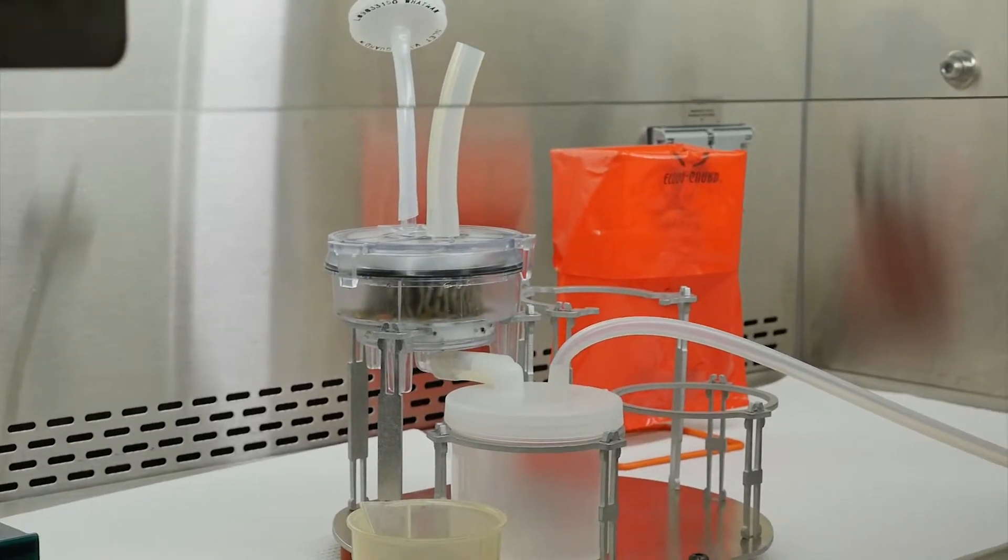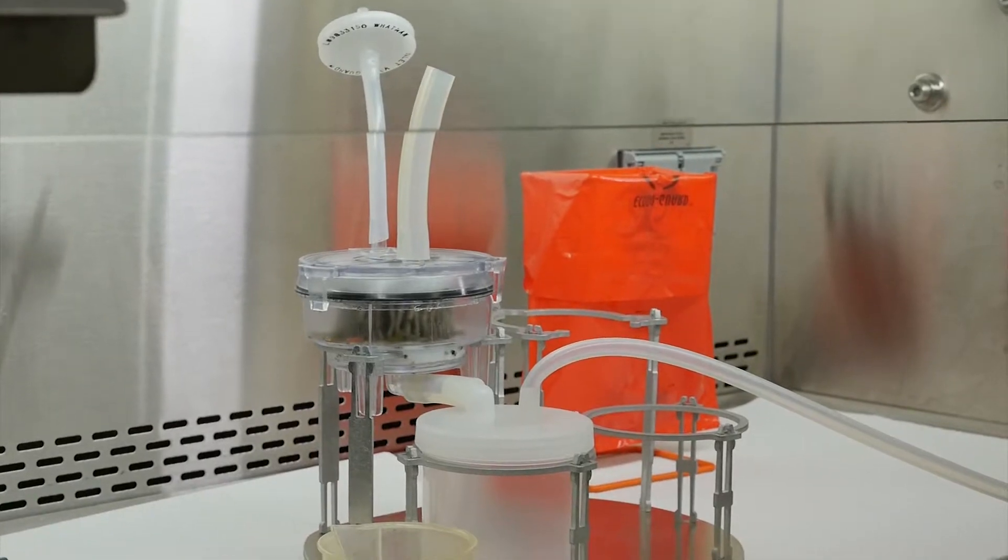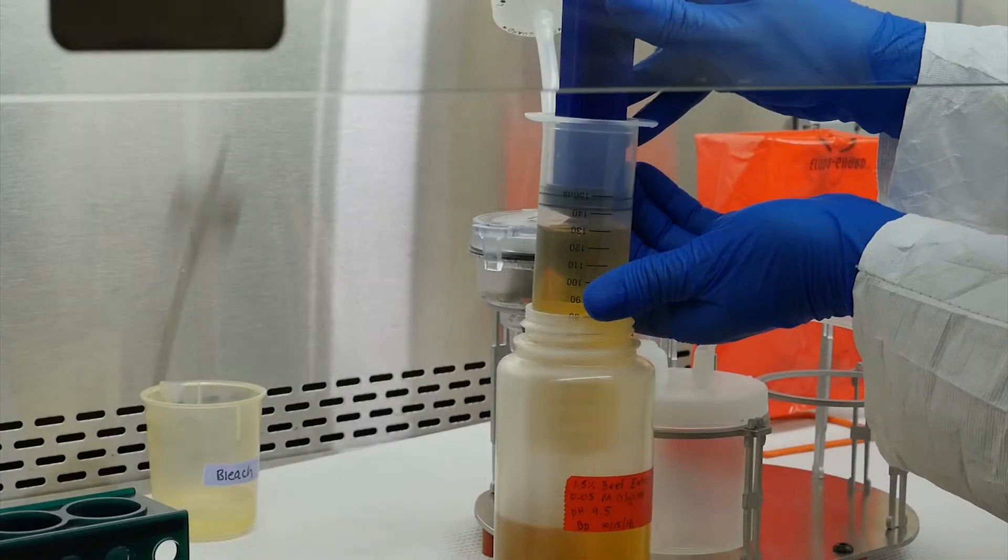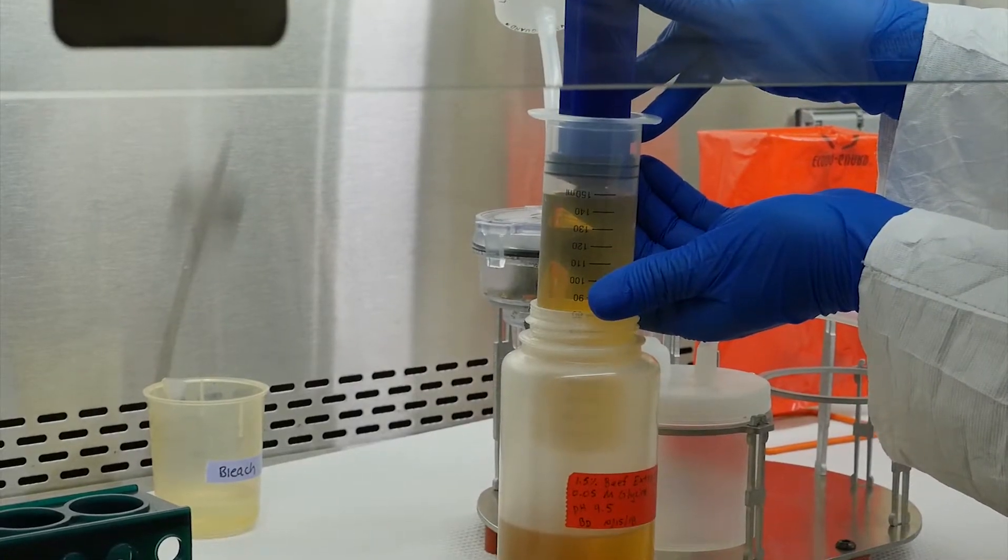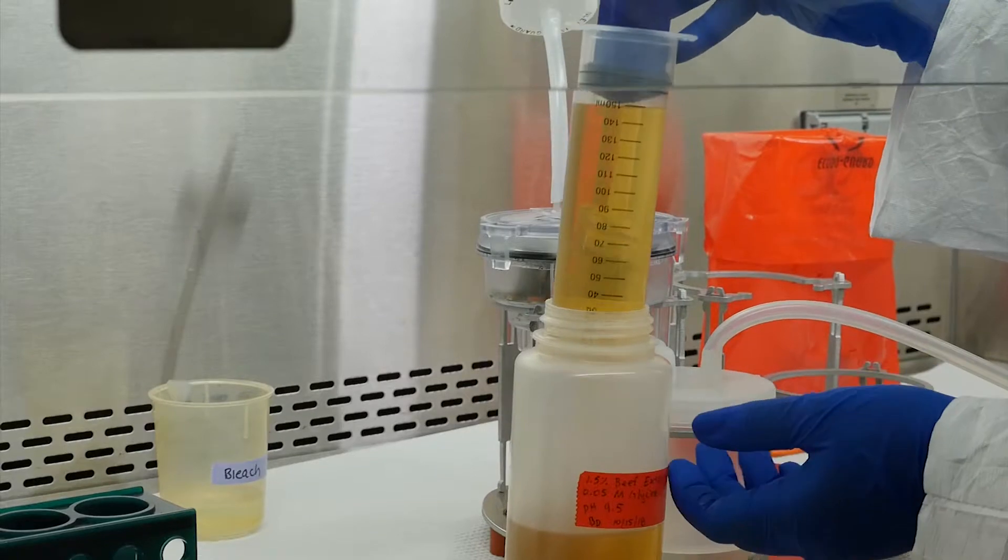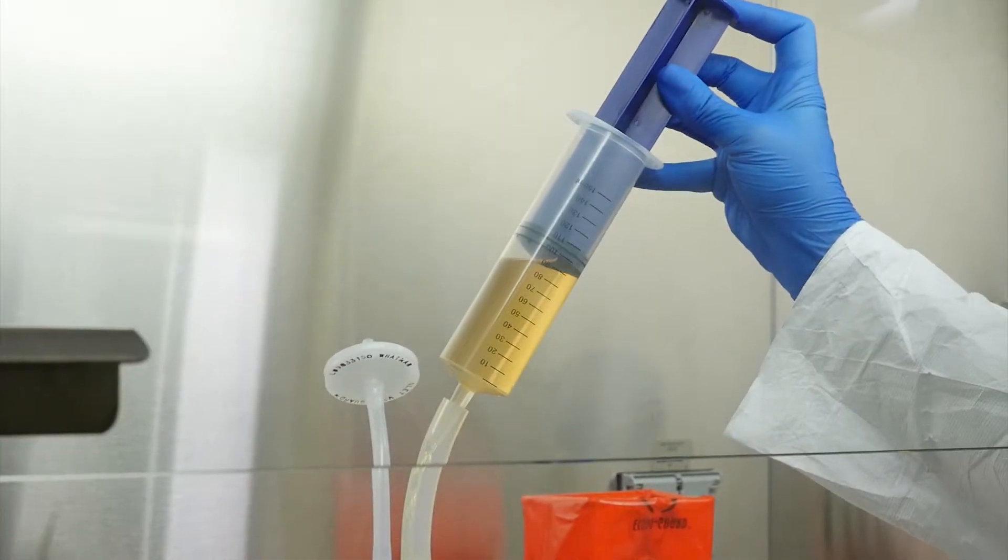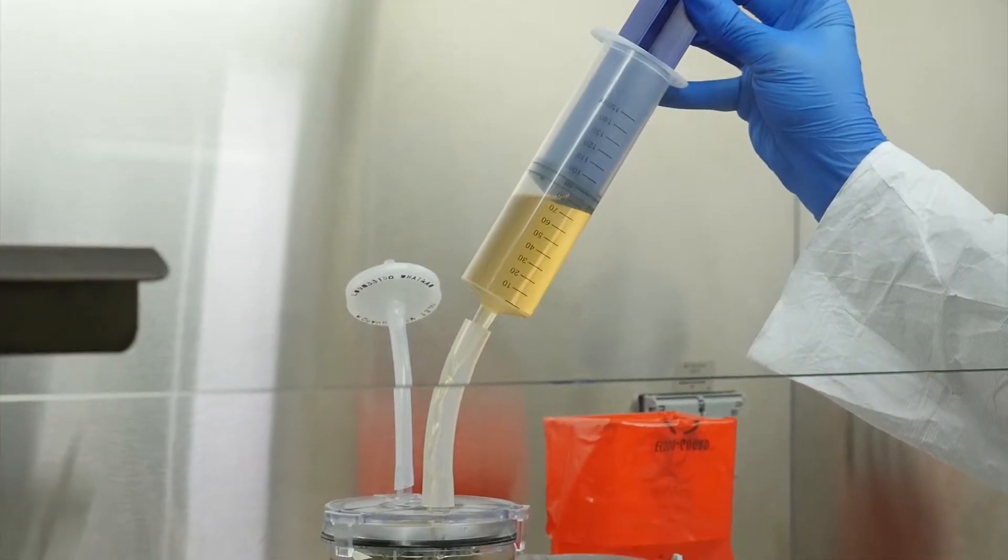Your setup should look like this, and you are now ready to elute your sample. Suction 150 milliliters of beef extract eluent into the syringe, making sure there are no air bubbles. Slowly inject the eluent through the injection tubing.